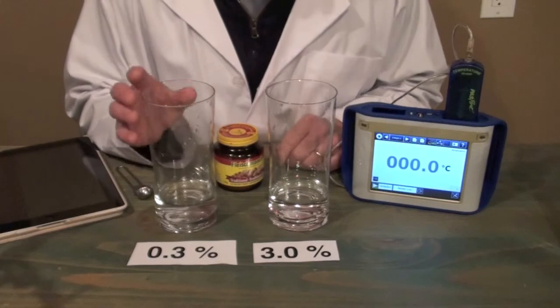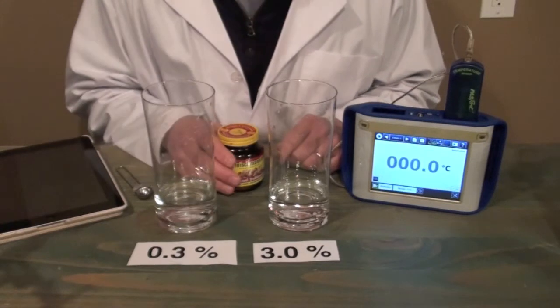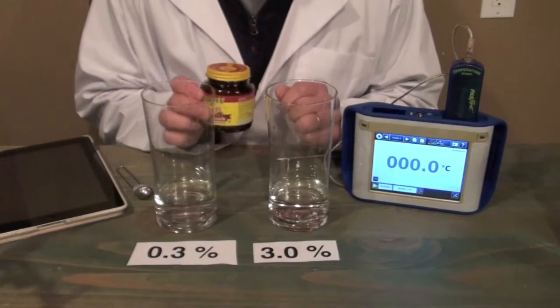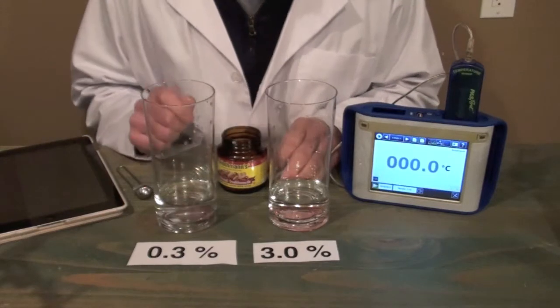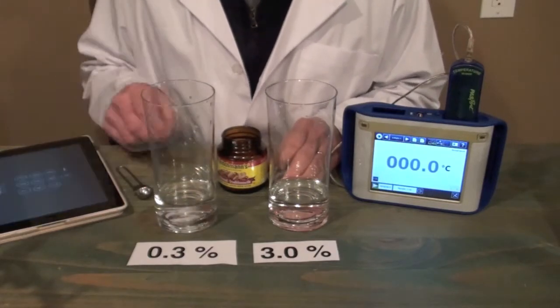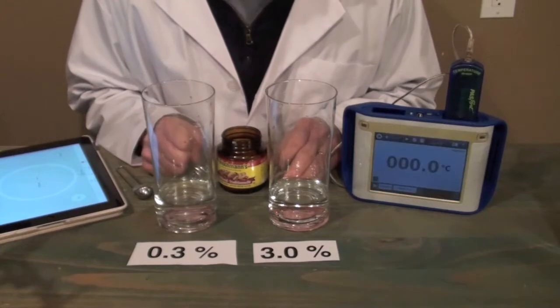Now, hydrogen peroxide decomposes into water and oxygen, and it does so slowly, but we can speed that up with a catalyst. And a really good catalyst for this reaction is yeast. So what we're going to do is put exactly 2.5 milliliters in each one of these containers, and we're going to then time the reaction for 1 minute and see how much the temperature changes.